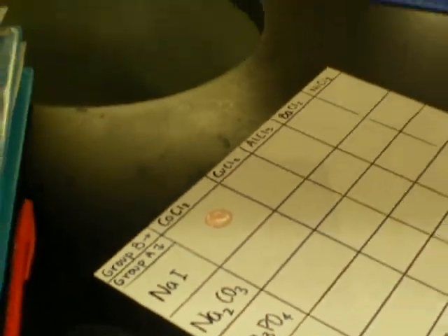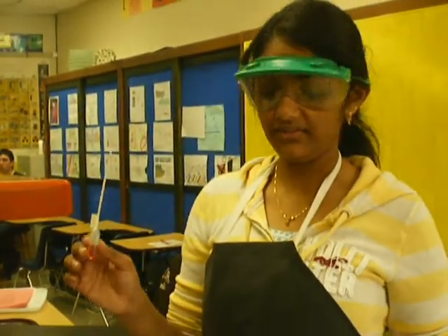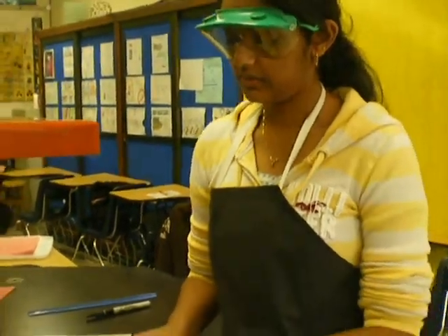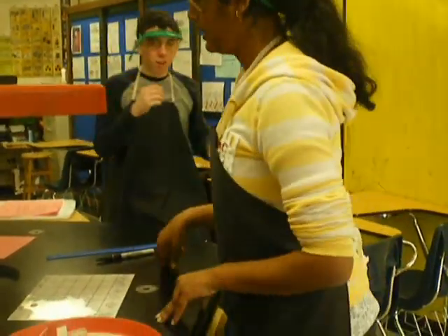Here, I'm just looking at it. As you can see, there really is no real reaction going on. There is no precipitate being formed. The only reaction that is there is a color change. You can see at first a red mixed with a clear turned into a really pale pink.